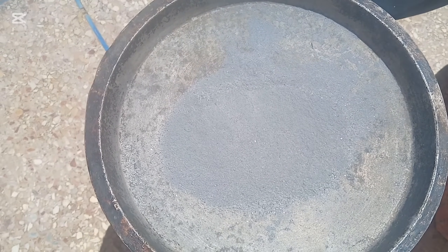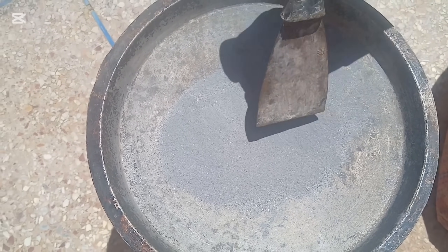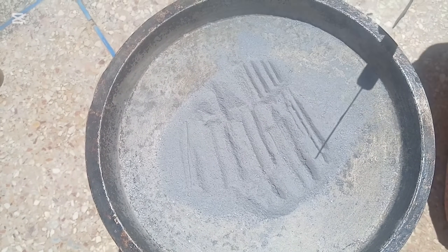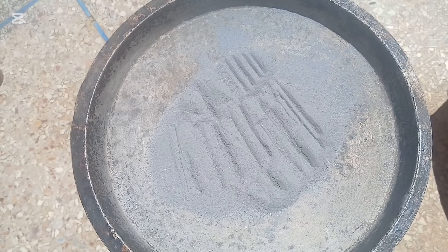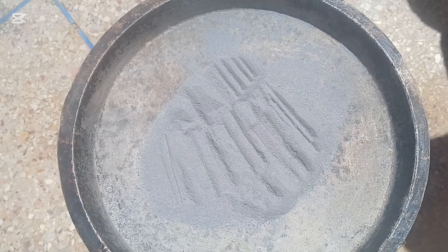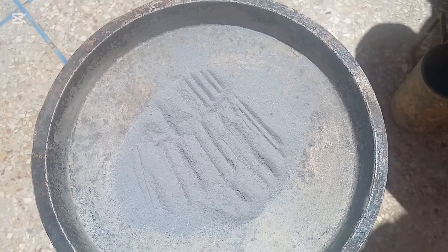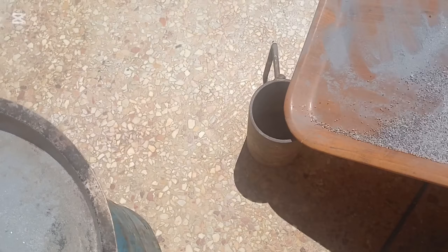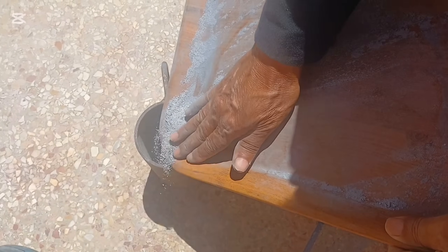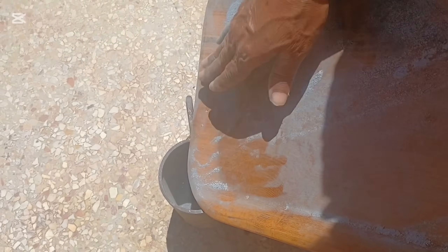We'll now move on to the next critical phase of our process: gravity separation. This technique is based on one of the oldest and most reliable principles in mineral extraction — density. Every material has a specific density. Gold and iridium are among the heaviest natural elements known to man. When compared to lighter minerals that make up most of the rock — like quartz, feldspar, or clay — the difference in weight is dramatic. In this step, we'll use water as a medium and tools like a gold pan, a sluice, or even a shaking table to separate the heavier particles from the lighter waste. As we agitate the powdered ore in water, the lighter materials will stay suspended or float away, while the heavier precious metal particles will sink quickly and settle at the bottom.